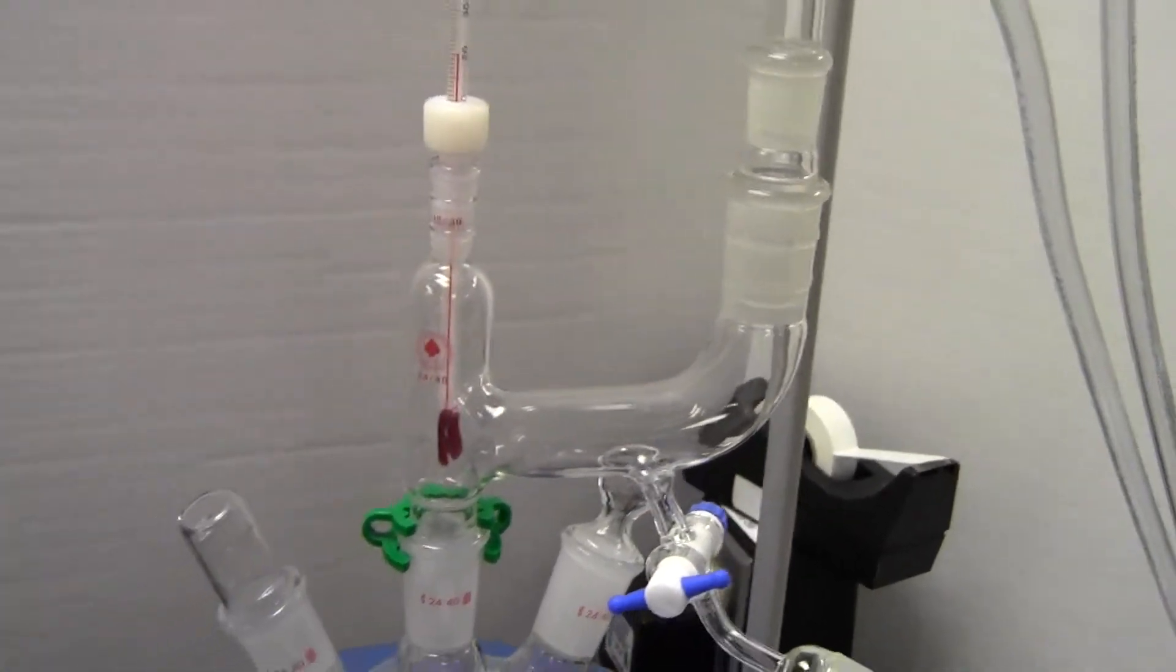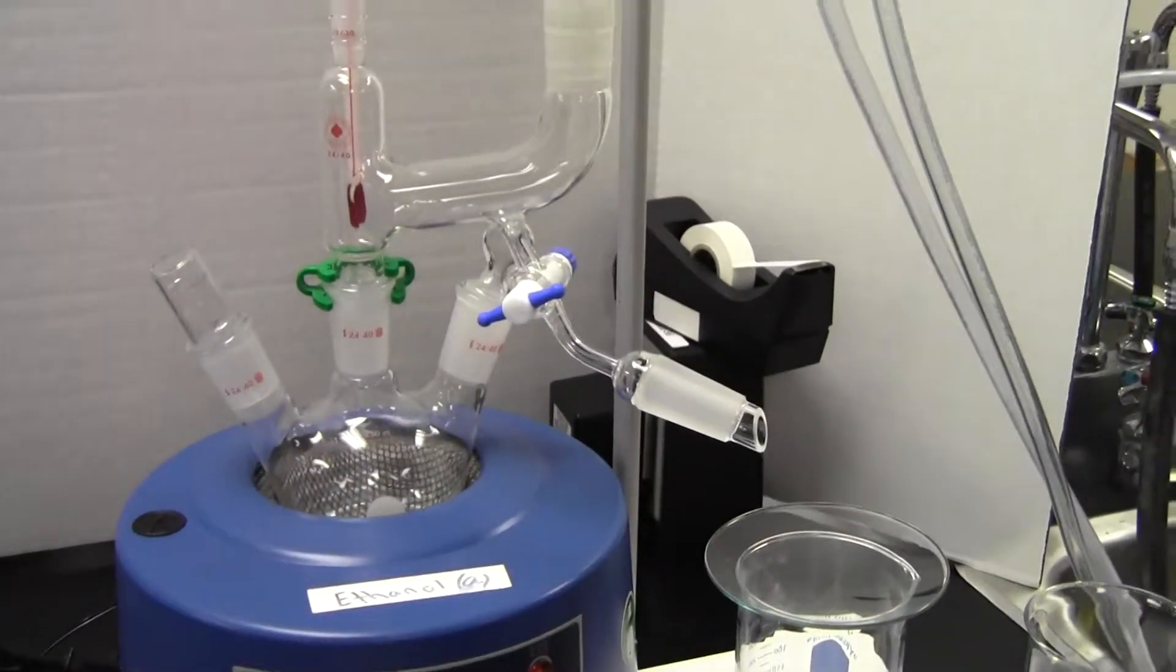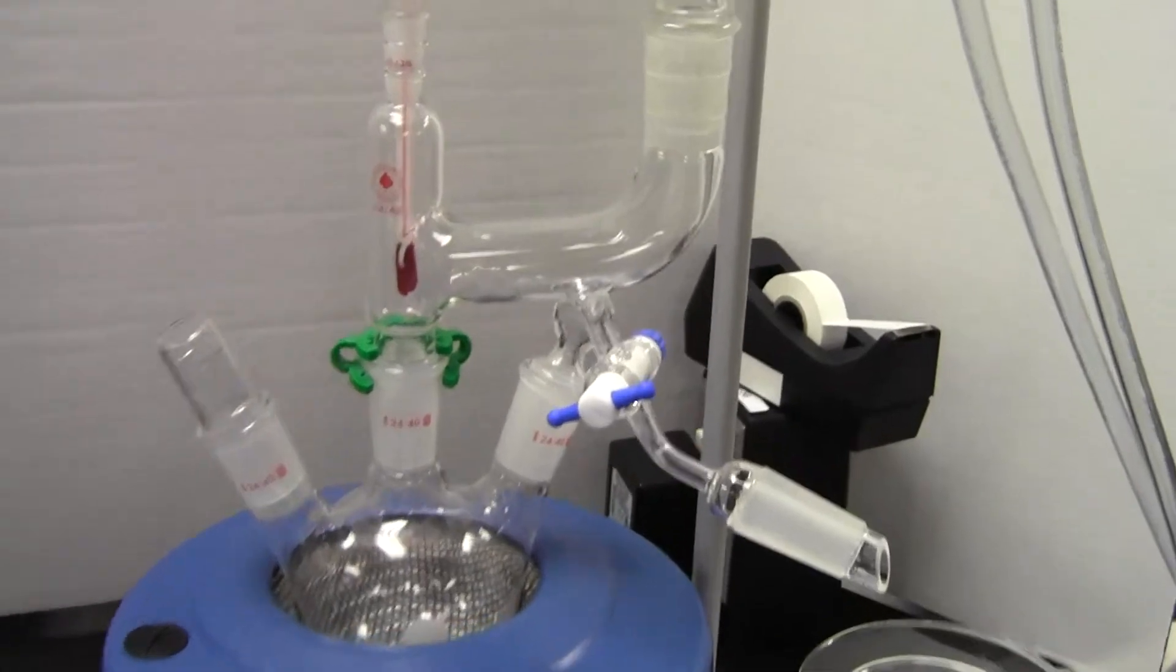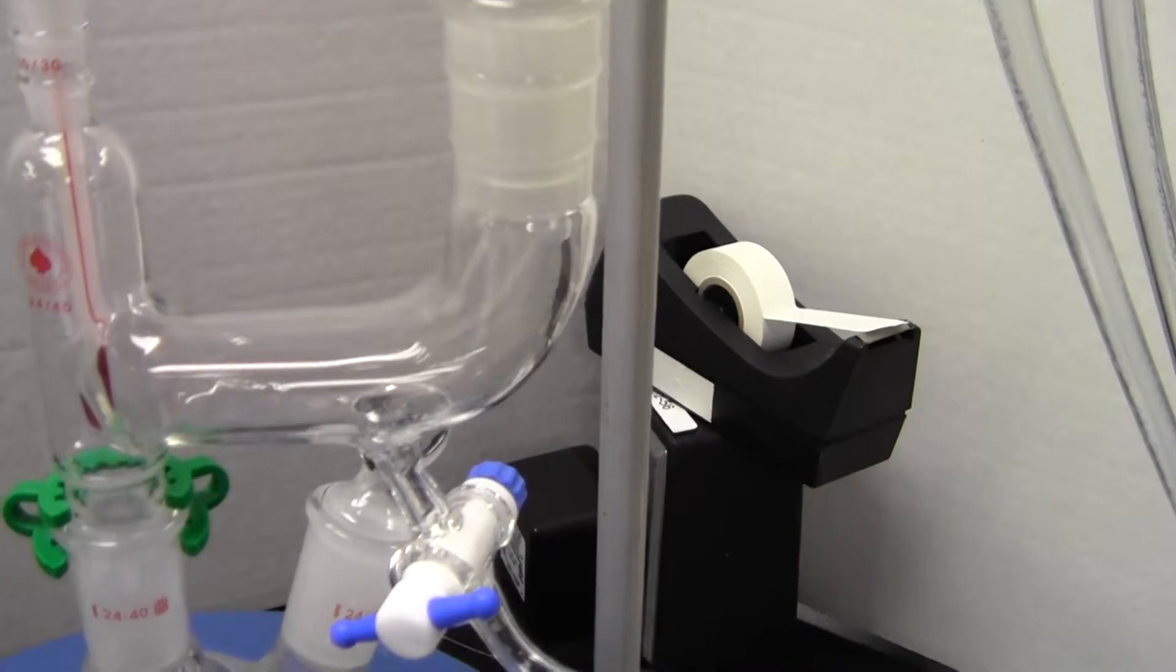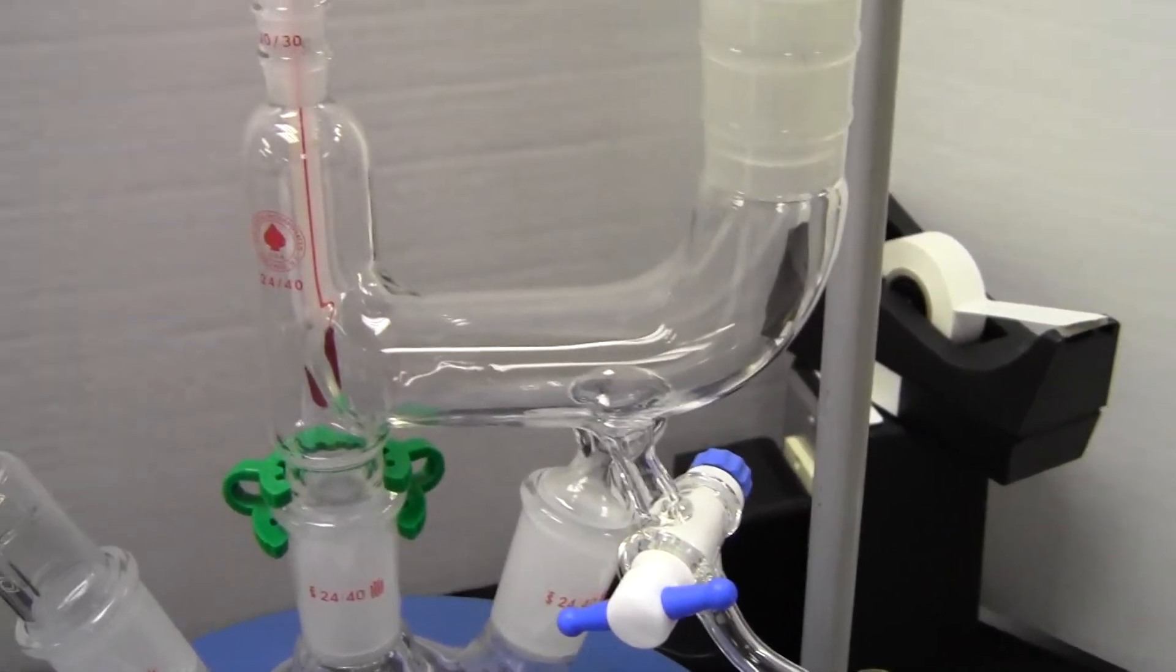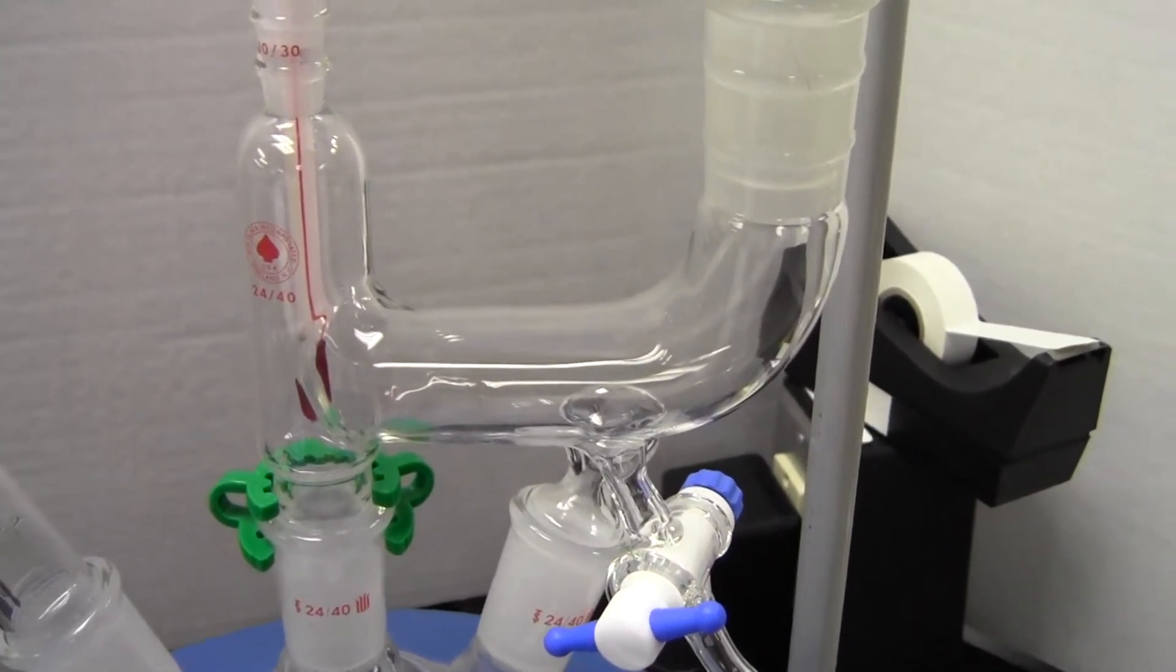When we have phase equilibrium between the vapor and the liquid, the temperature is recorded right there at the interface. Bring the ethanol to a boil and record the boiling temperature. Don't record it too quickly; make sure it's steady.